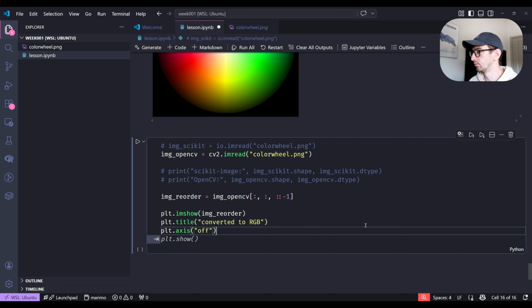I tried to make a variable corresponding to each color and reset them in the right order, but the image came out grayscale, so I think it's a wrong solution. I see. Let's try to do it together, guys.